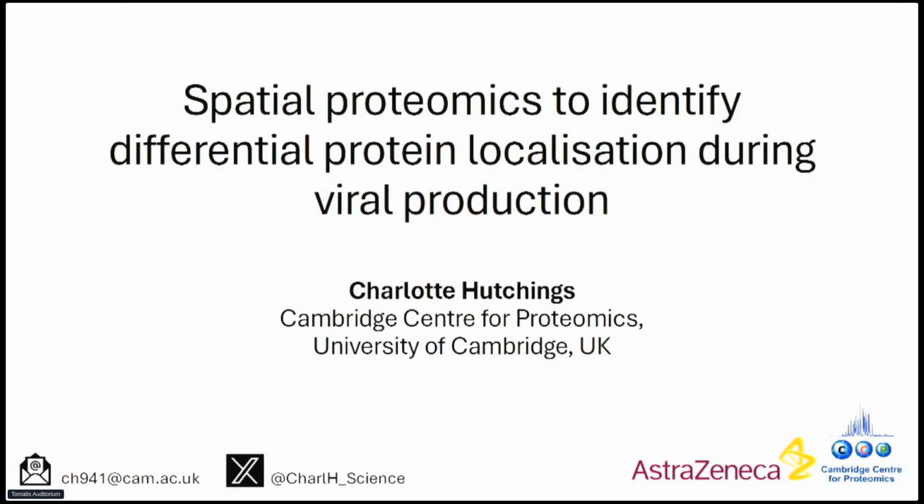Hello, everybody. I'm Charlotte, and I'm currently a third-year PhD student over at the University of Cambridge. And today I'm going to tell you a little bit about what our lab does. We focus on subcellular proteomics, so we're not talking about tissue level anymore. And I'm going to tell you about my project using subcellular spatial proteomics to try and identify moving proteins in cells when they're producing virus.